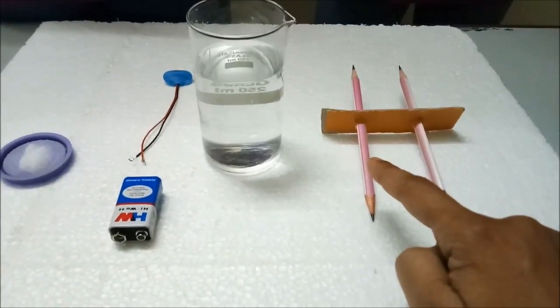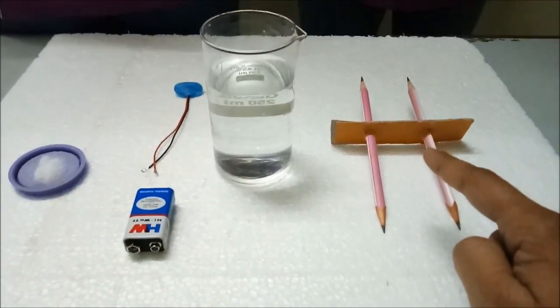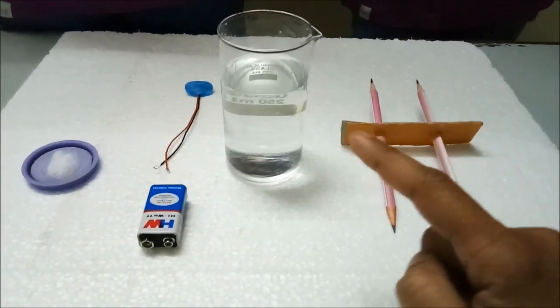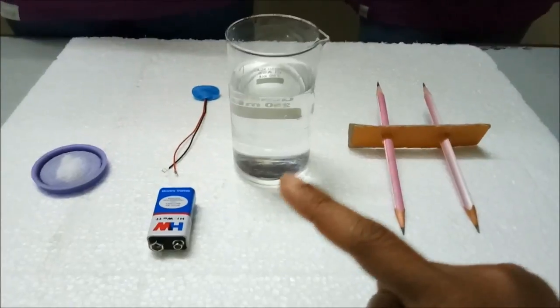Always remember oxidation takes place at anode and reduction takes place at cathode. You will see that as we pass electric current through water, water will break into hydrogen and oxygen.